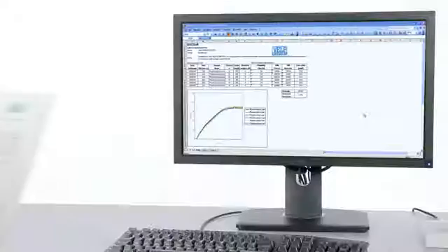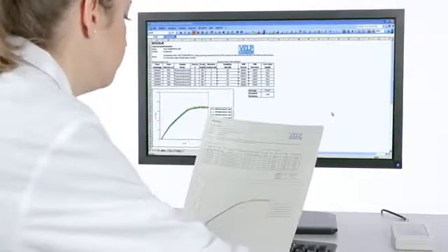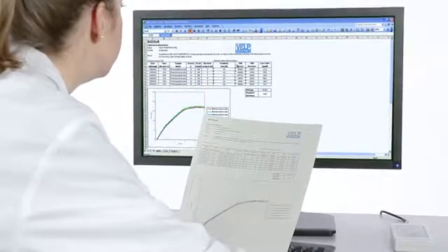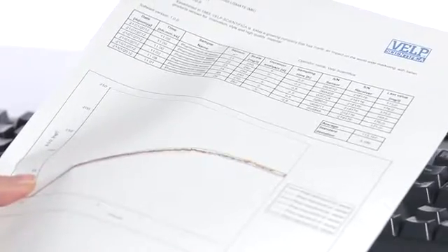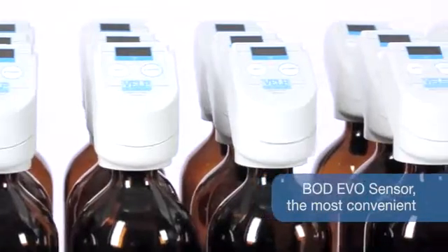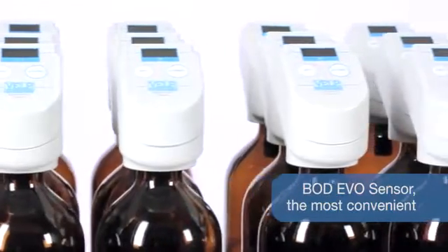Single or multiple customized test reports can be created. All the results and reports can be output to a printer or saved for GLP compliance. BOD-EVO is the most convenient way to get reliable results automatically on the biochemical oxygen demand.